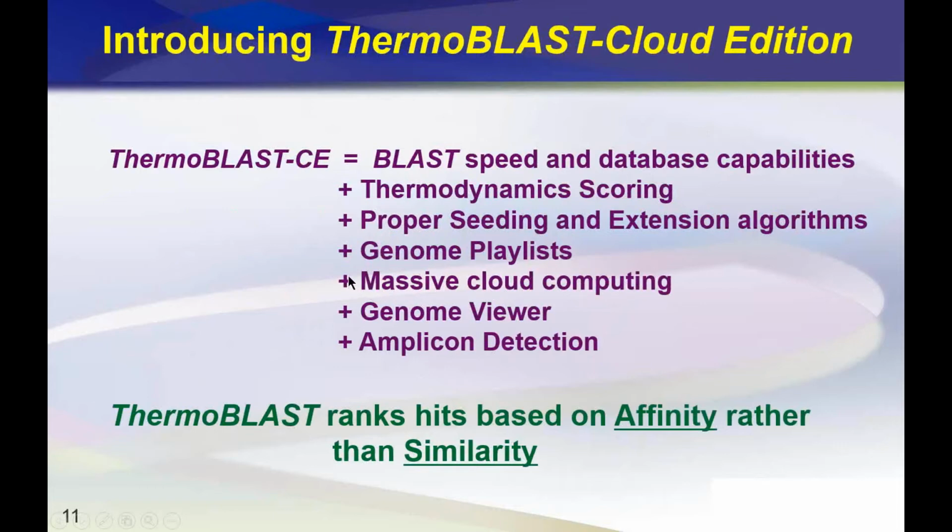Massive cloud computing allows for quick computation times, and there's a new Genome Viewer application that allows you to basically do a reality check to see if the primers you've designed are binding to the intended site, where you can see the GenBank annotations in the Genome Viewer. And then lastly, automatic detection of the amplicons. So in summary, ThermoBLAST ranks hits based on affinity rather than similarity. So it's a totally different model.